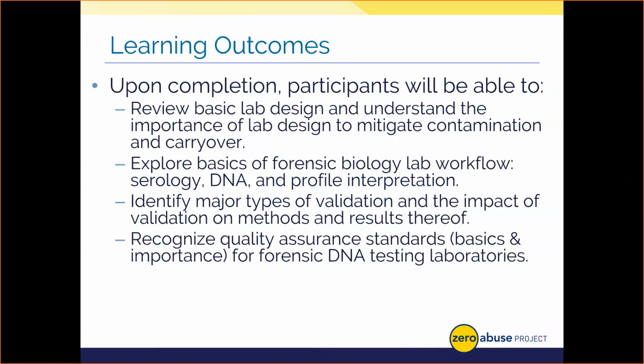We're also going to round out the conversation today by exploring how validation studies and quality standards ensure that not only the most rigorous methods and techniques are deployed for your testing needs, but that also we can be confident in the data that's delivered by an analyst, so that it cannot be easily combated by defense counter arguments that are centered around method validity and procedural robustness.